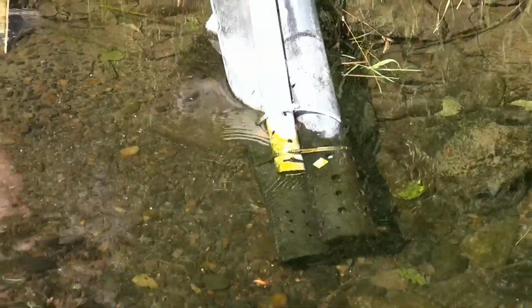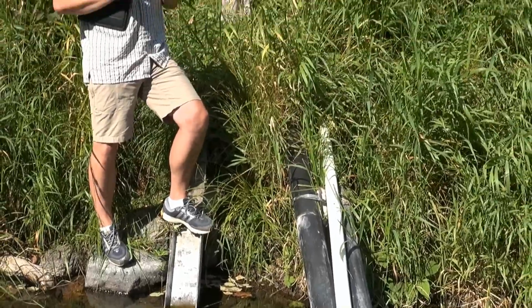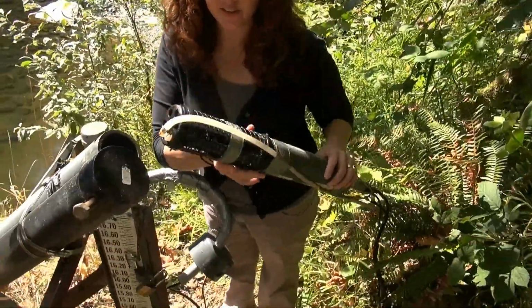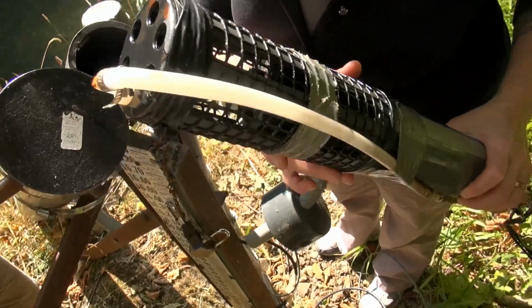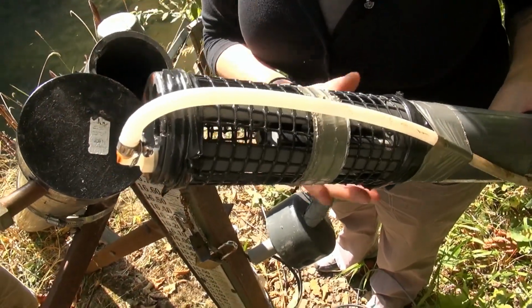Do they freeze up? Nope. We hardly ever get freezing. So here we've got DO, it's a little hard to see in there, optical DO and turbidity, both with wipers on them. You can see in there. Oh yeah, quite small diameter.